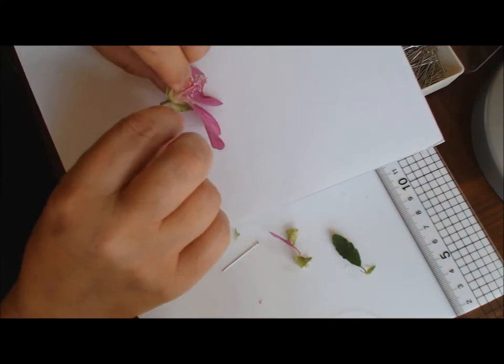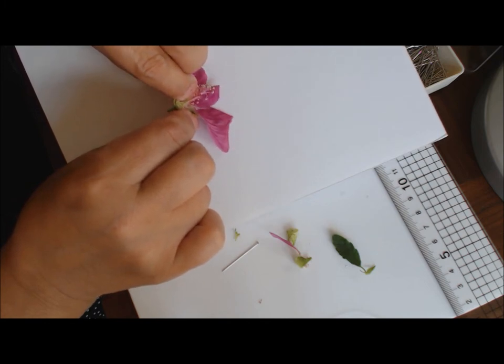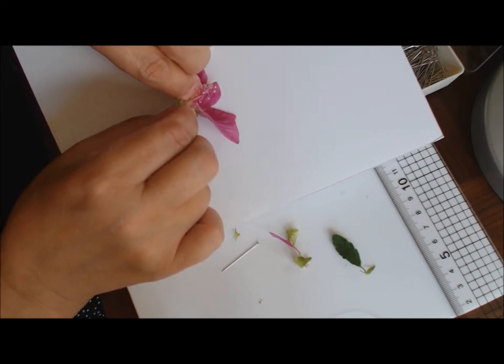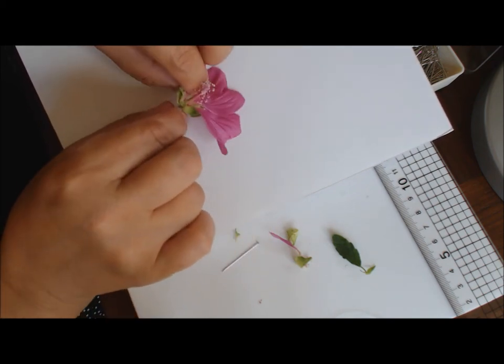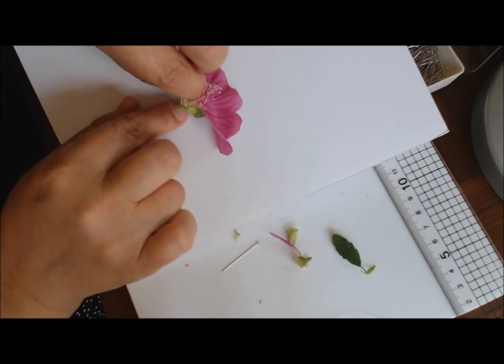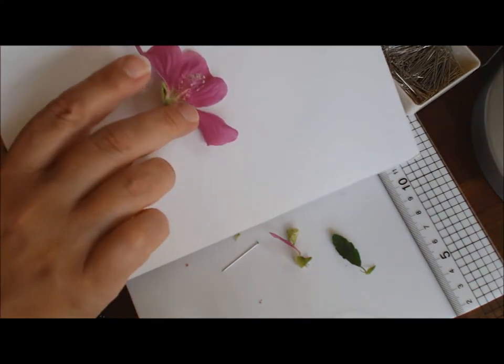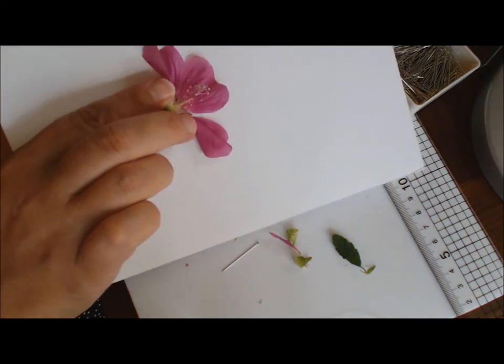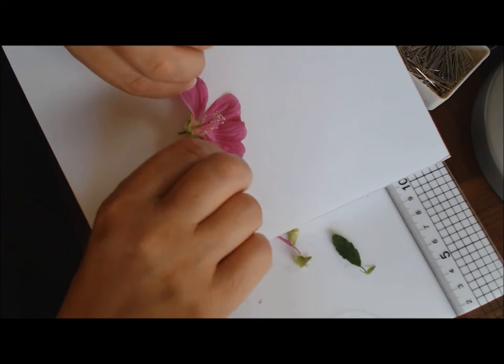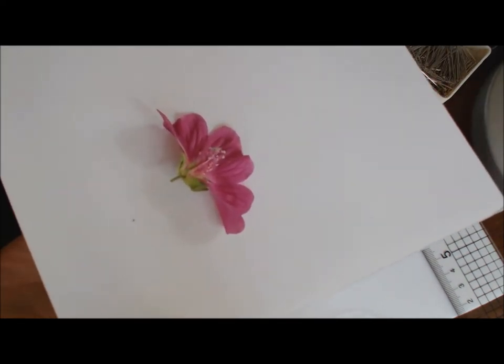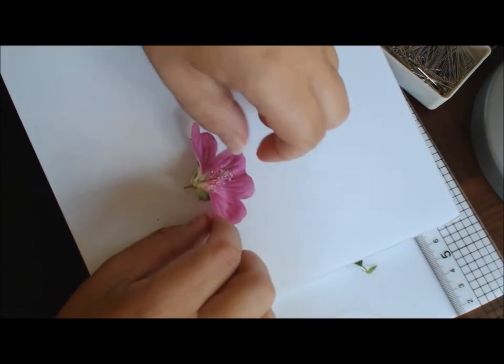And skewer the flower through the ovary or the receptacle. Make sure you get it in position. Slightly fiddly. And again, be careful. That positions your flower into place with just a cross section of it.